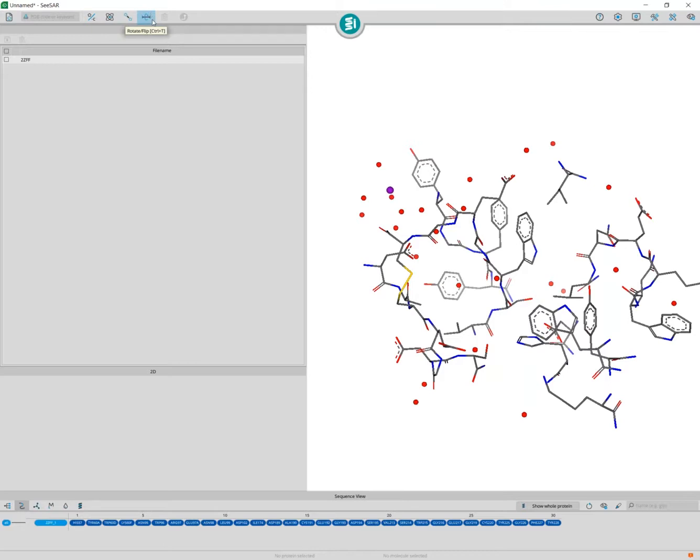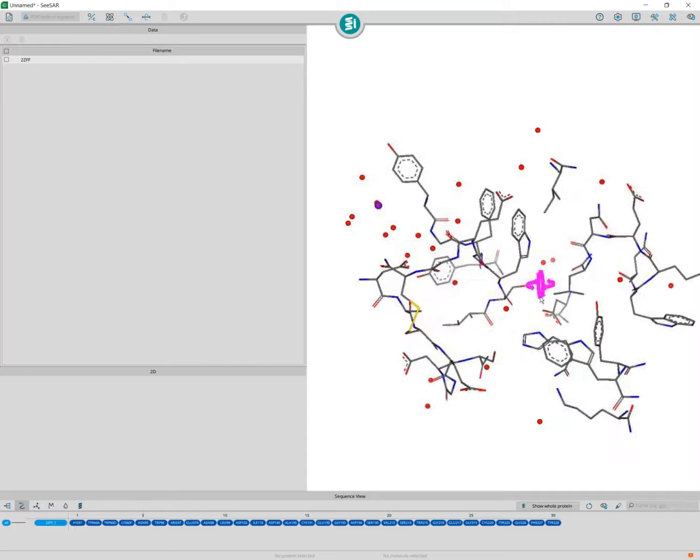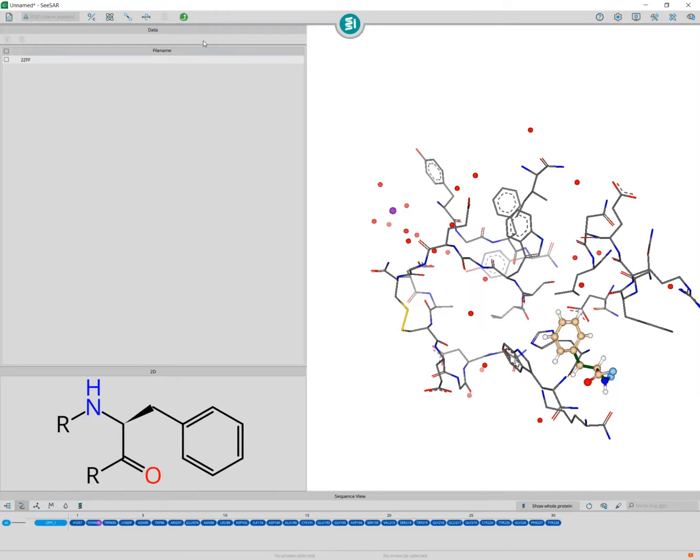Sometimes when you have an arginine that doesn't do the interaction that you are expecting it to do, you might tweak it a little bit towards the binding site. Or you can do mutations. Let's say I have here my tyrosine. I double click on this and now it's in the active state. I can select the hydroxyl function and just put it into the bin, making a phenylalanine from it, and save my edited protein to the table.